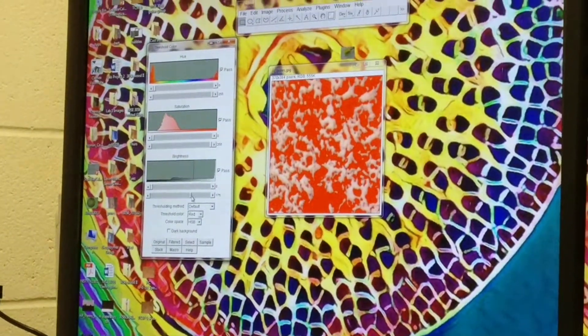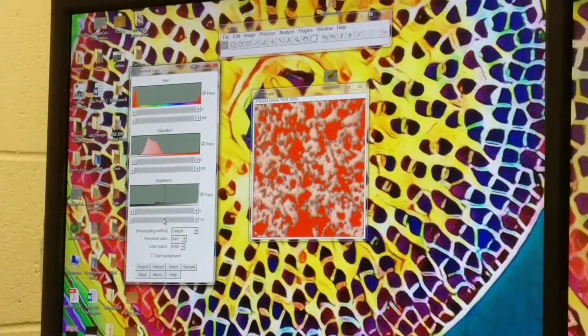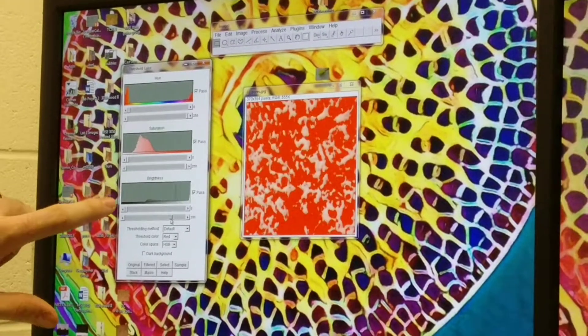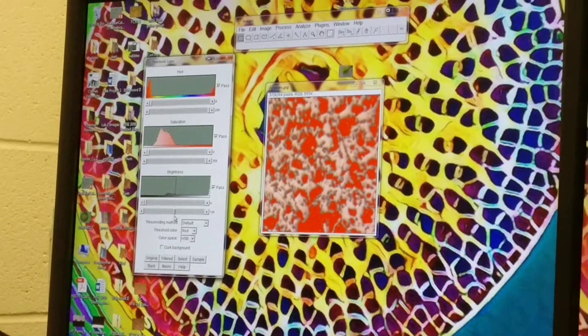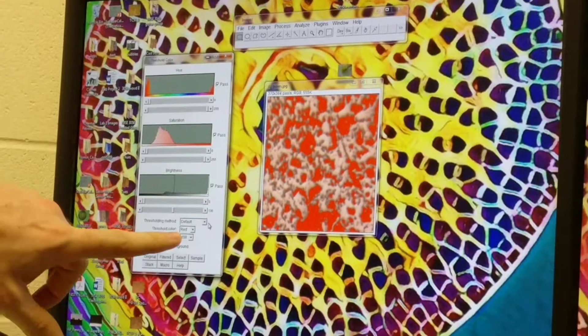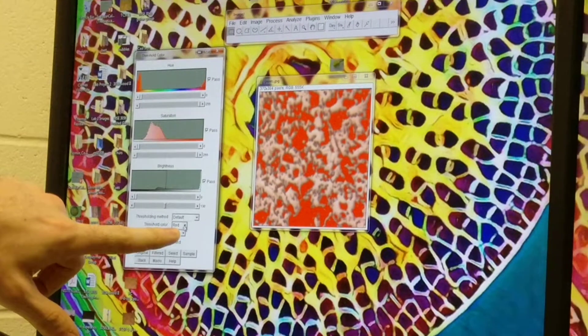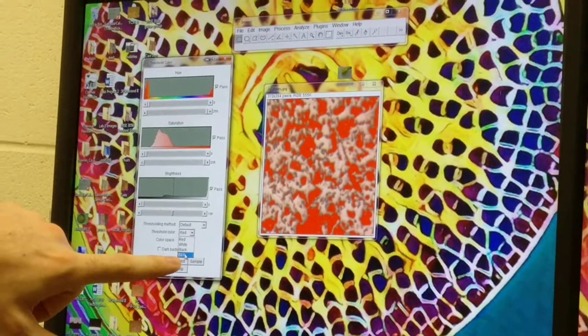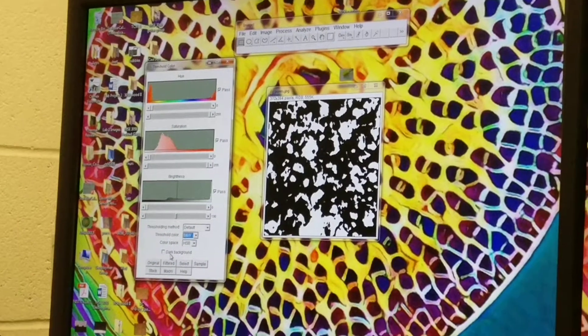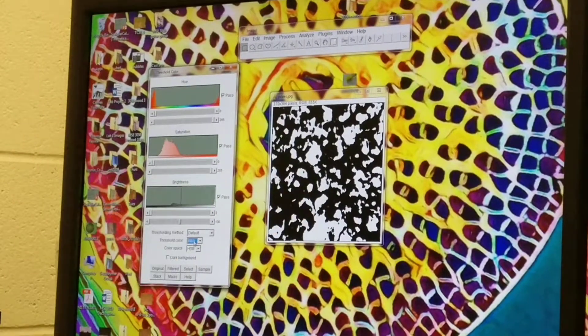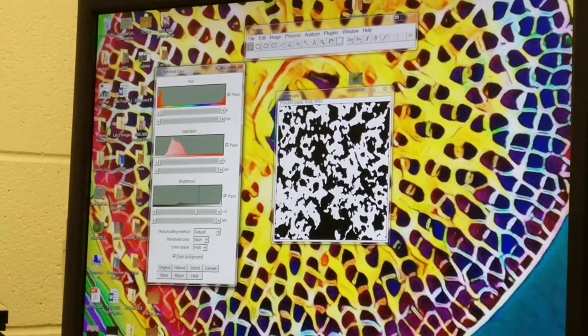If we uncheck this dark background, you'll notice the pores are actually selecting the darker portions of the image here. Pick a reasonable area. Then instead of red as the threshold color we're going to change that to B and W or black and white. You'll notice the pores are actually turning white here, so I'm going to check dark background again to invert it.